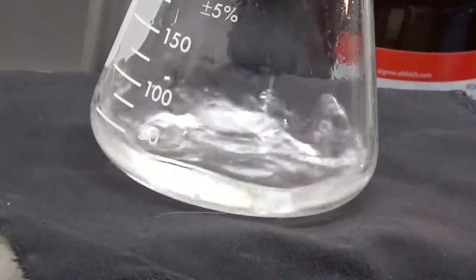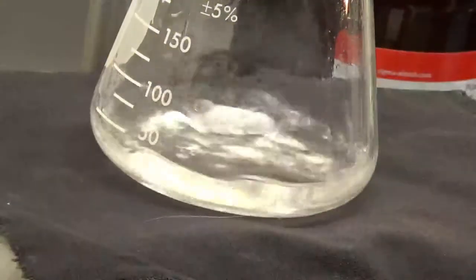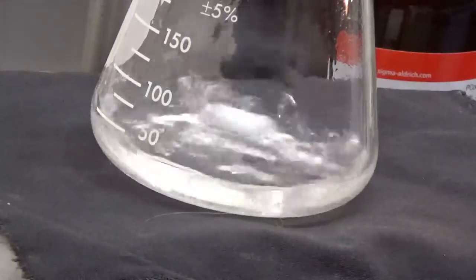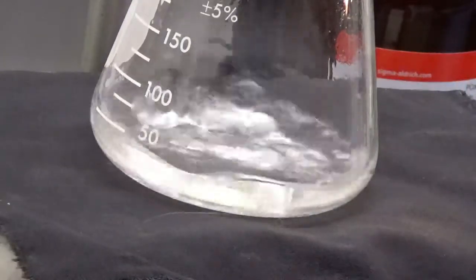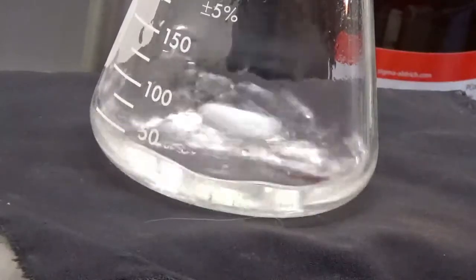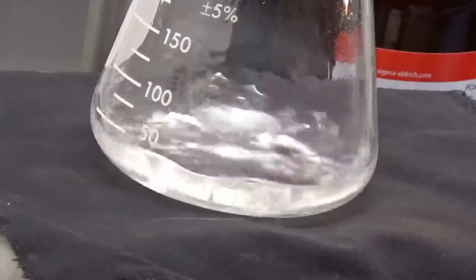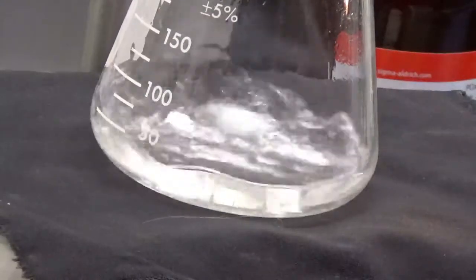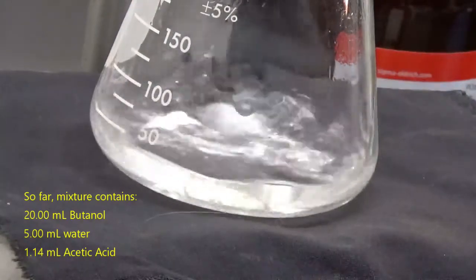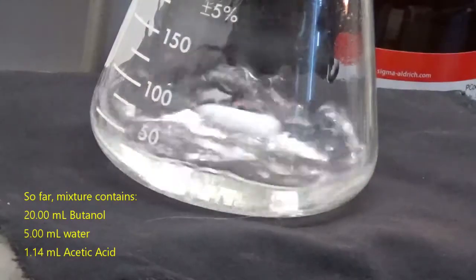Oh, I think it looks clear now. Oh my God, it really is clear now. Very cool. I haven't done this experiment myself in years, but I think that was pretty clear. Okay, so this is 1.1, let's call it 1.14 milliliters.